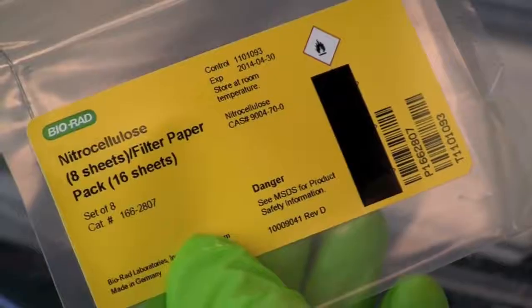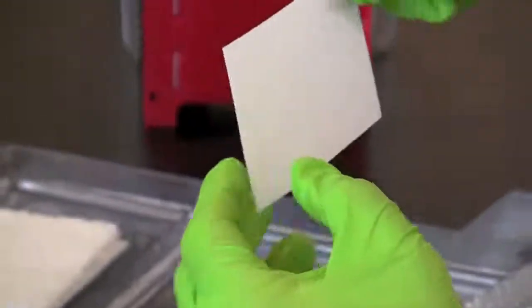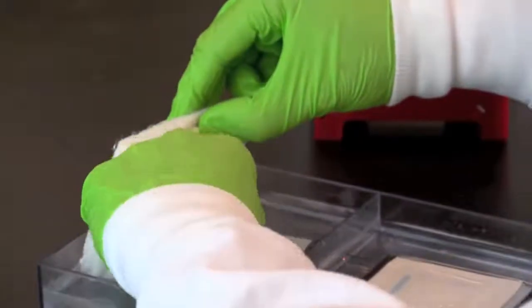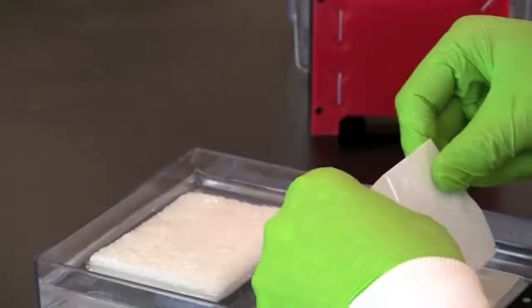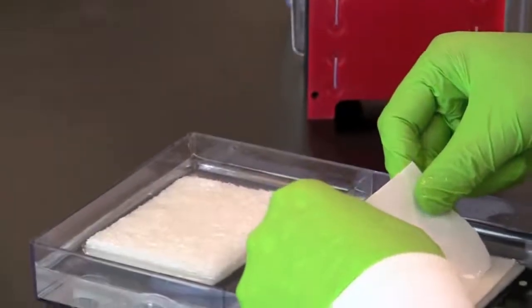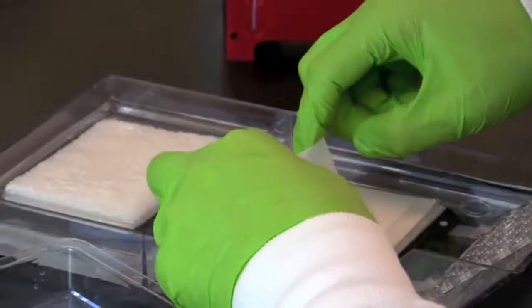Next you will be applying a piece of nitrocellulose membrane. Remove the protective sheet from the membrane and wet the membrane with blotting buffer. Carefully place the membrane squarely on the gel. Avoid moving the membrane once placed on the gel as proteins will begin to blot immediately.